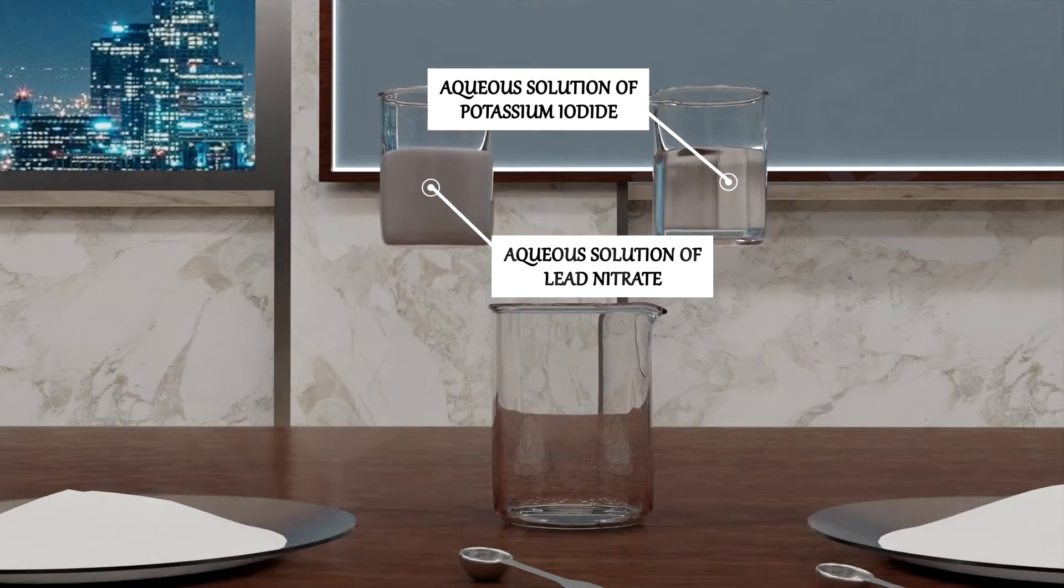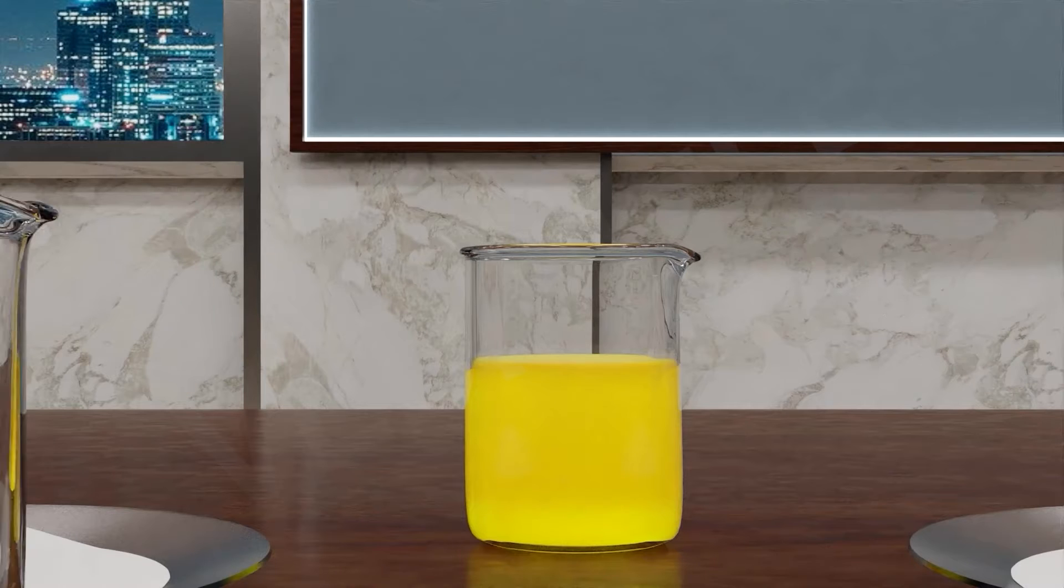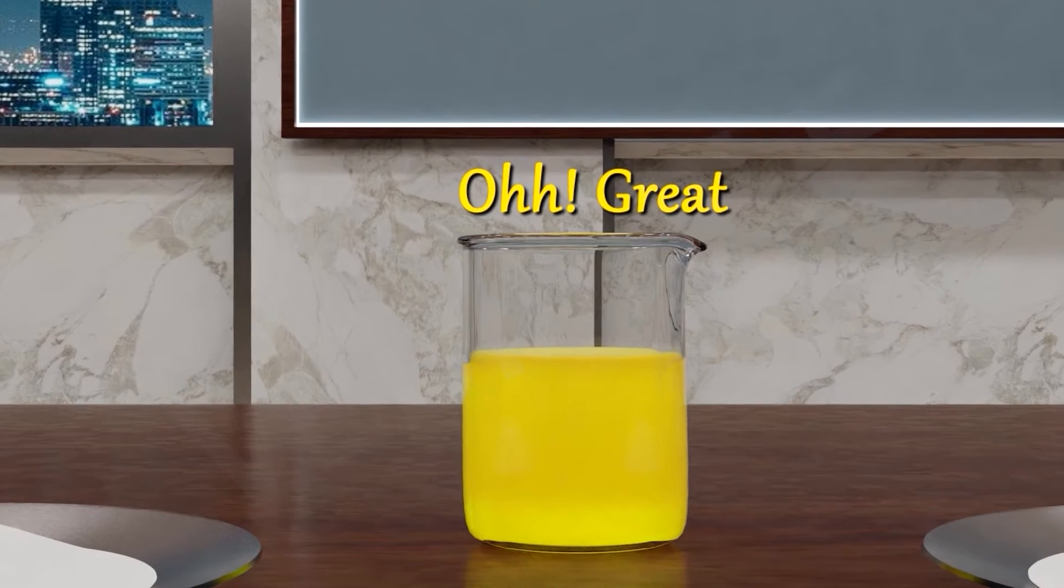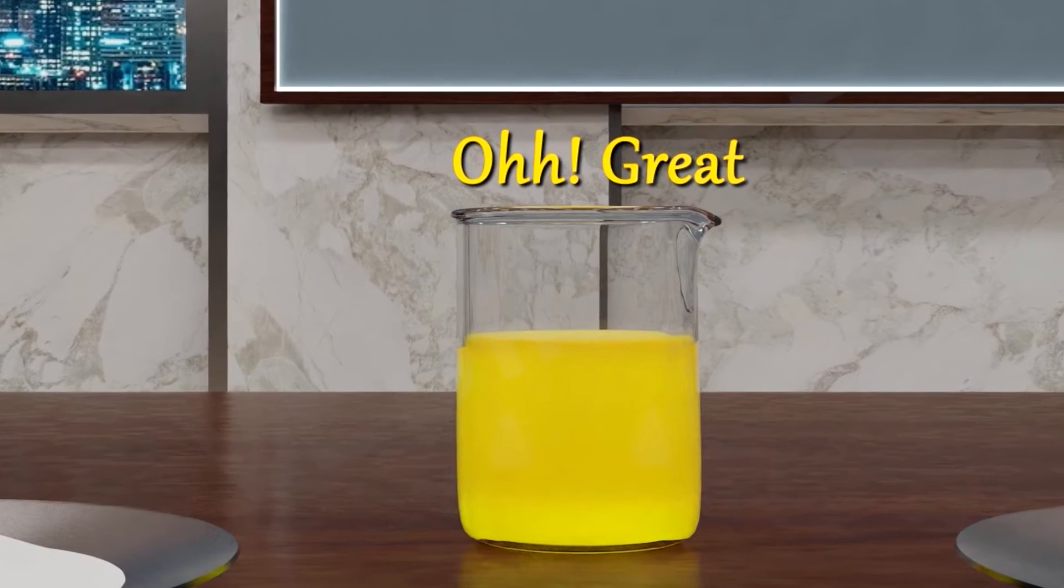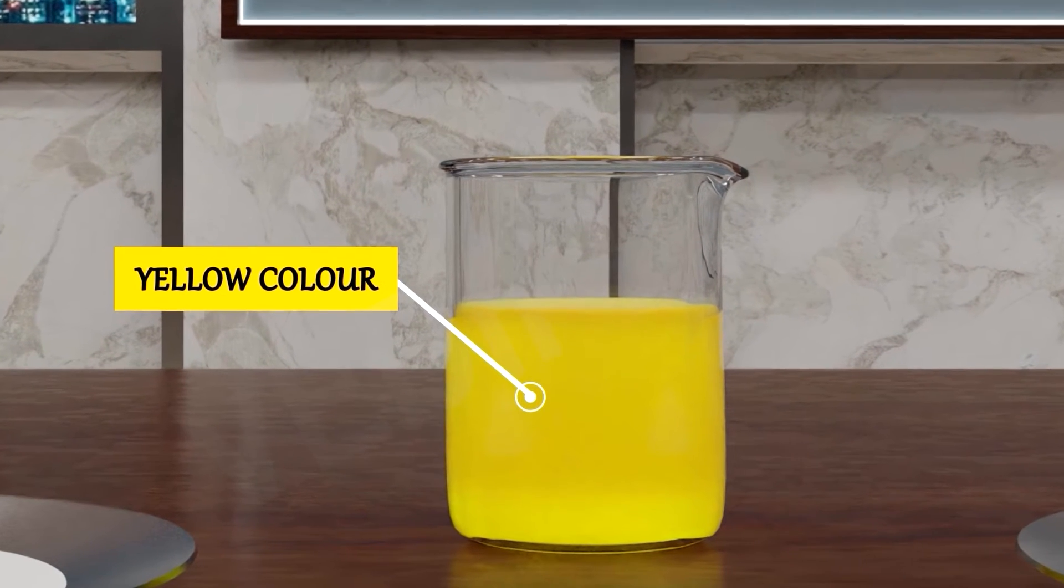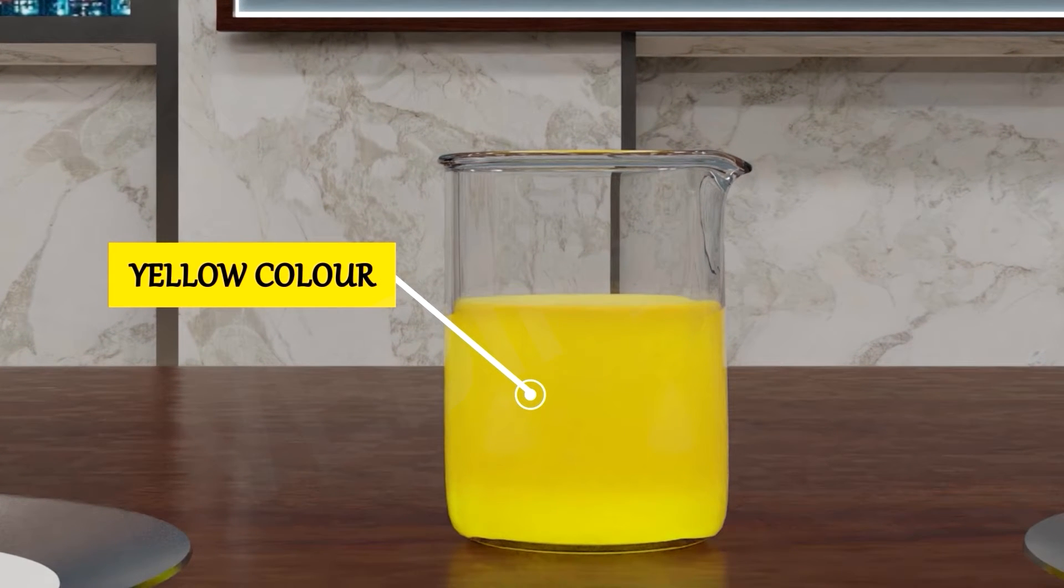Now we will mix both of the aqueous solutions. Oh great! Now what is the new color? It is yellow. So this is a chemical reaction.